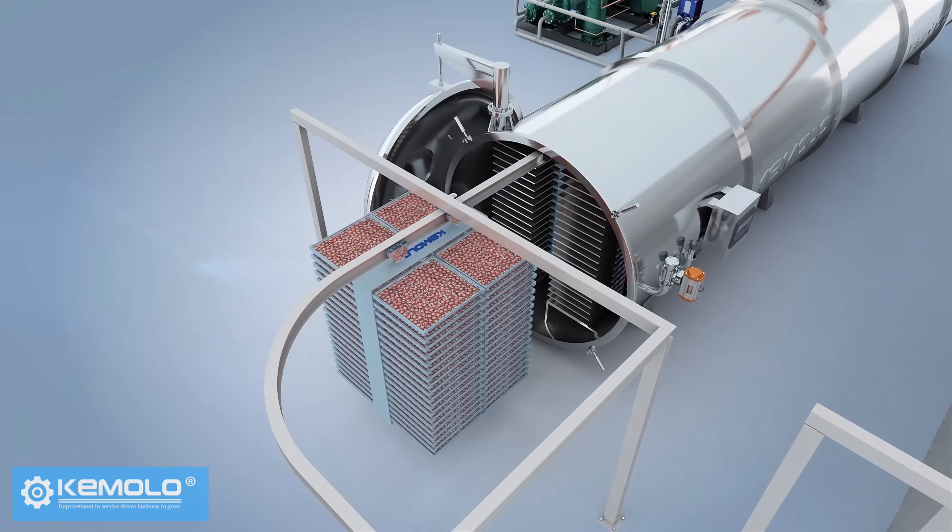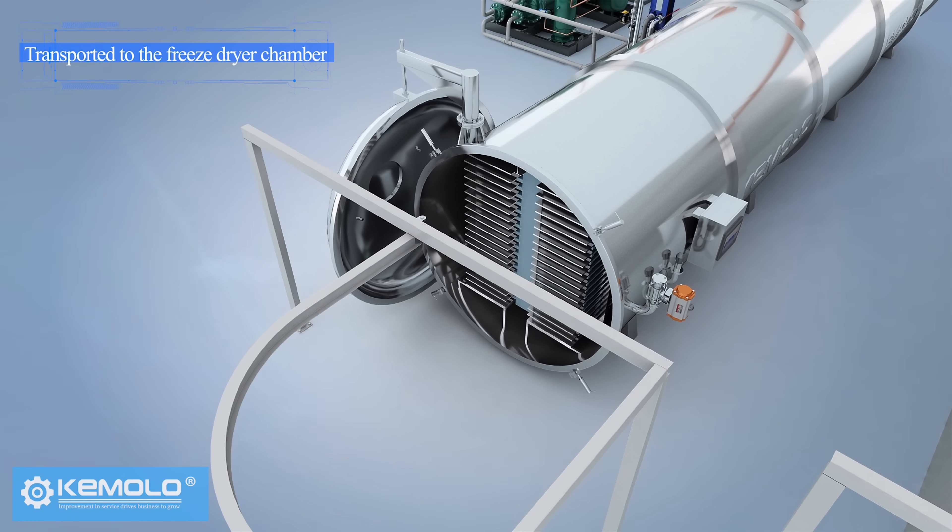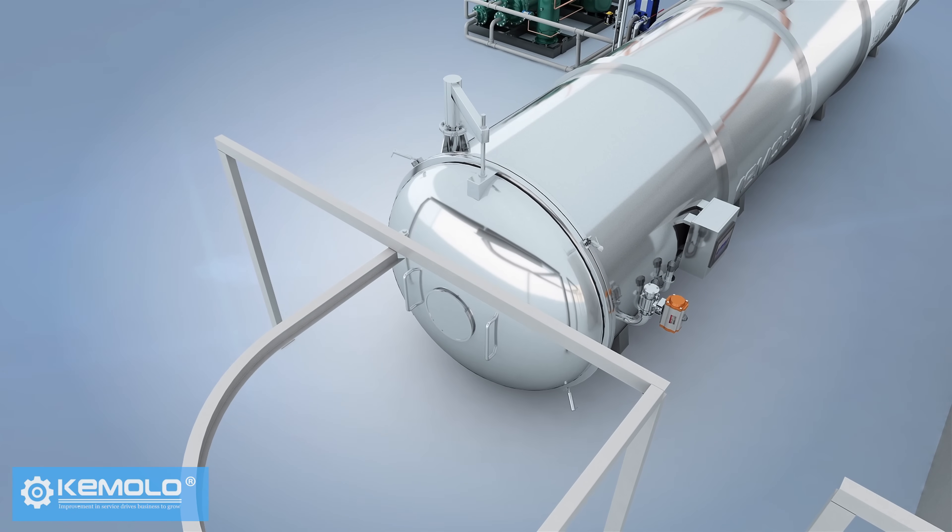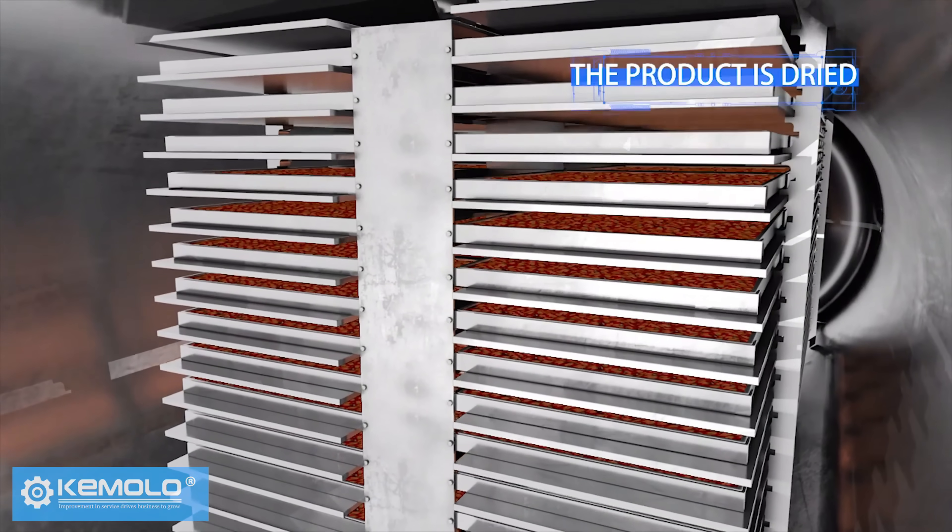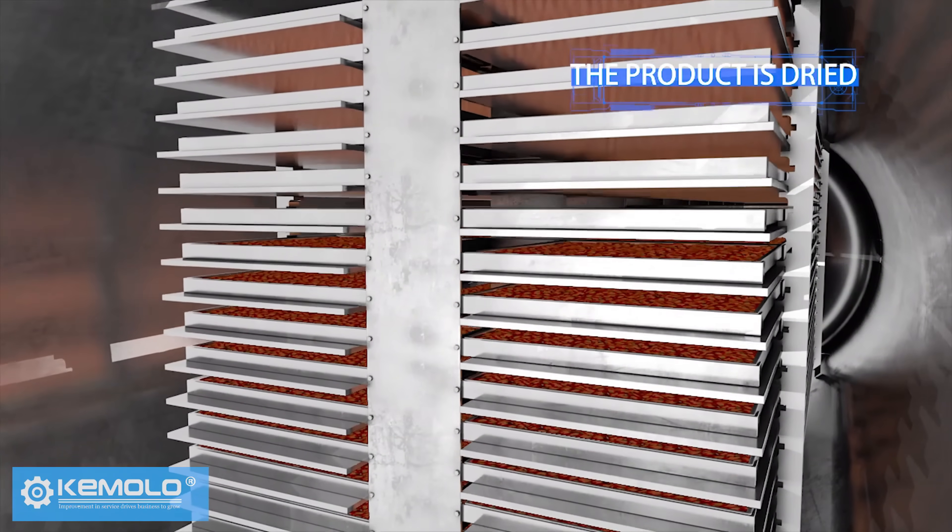The frozen material is then transported to the freeze-dryer chamber. The chamber is closed and it is ready to freeze-dry. When the material temperature reaches the set temperature, the product is dried.